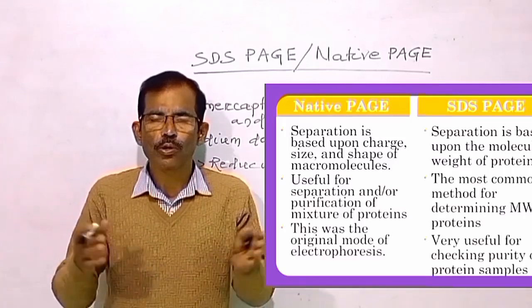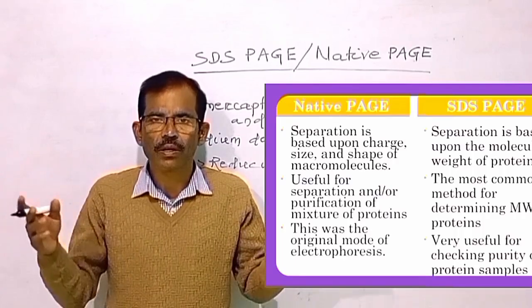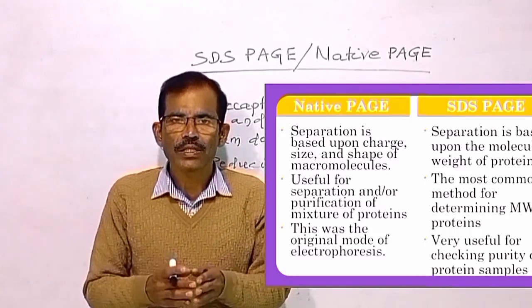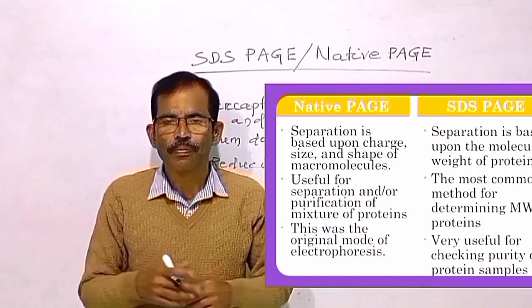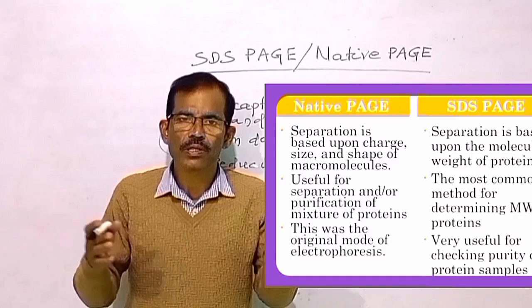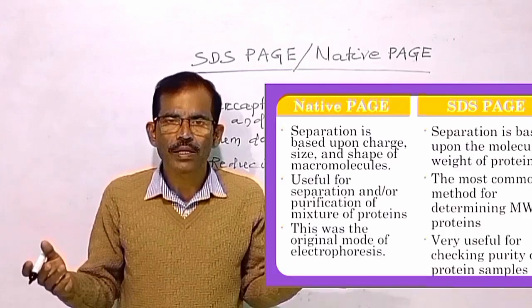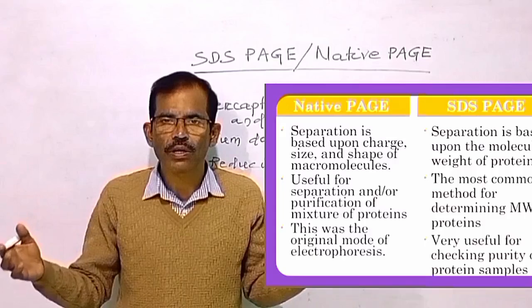This is because the protein sample is denatured prior to the electrophoretic run. Whereas in case of native PAGE, proteins are separated based on their size, shape and net charge density. In addition, in SDS-PAGE, it is not possible to recover the proteins post-separation. Whereas in case of native PAGE, separated proteins can be recovered after electrophoresis.